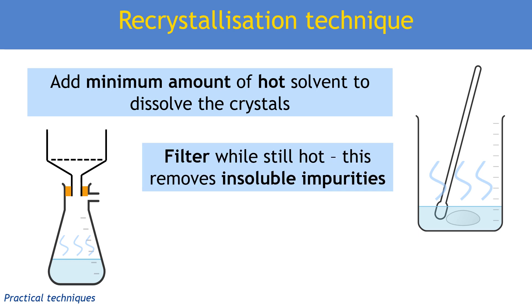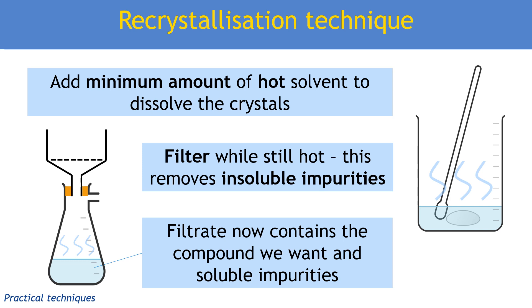While it's still hot, we should filter it. Some practical procedures miss this step out, but the reason we should do it is to remove insoluble impurities such as anti-bumping granules or bits of dust. There shouldn't be much on the filter paper, but this step ensures they're not in my final solid. What I'm now left with in my hot filtrate is the compound I made — for example, aspirin — and also dissolved in that filtrate are all of my really soluble impurities.